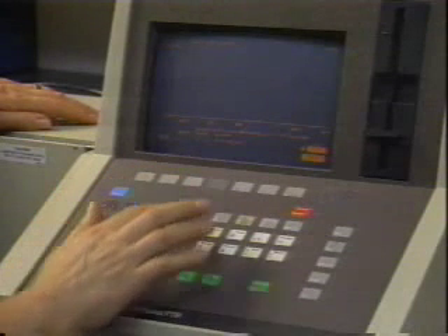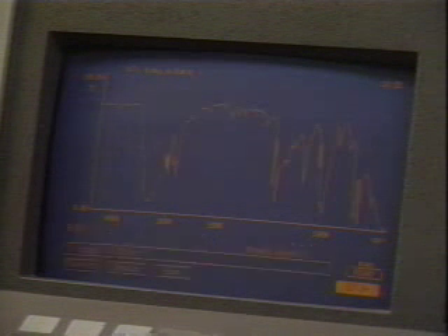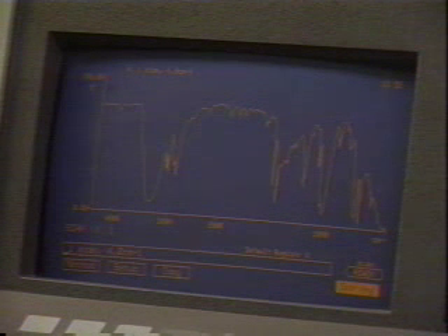Next, choose the number of scans, generally one or four. Note how the screen goes blank as it erases the last spectrum in the storage region X. When you press the soft key under the '1' on the screen, it will tell the instrument to scan one time and go ahead and do it. In four seconds, the instrument will have scanned your sample one time, computed the spectrum, and placed it on the screen.